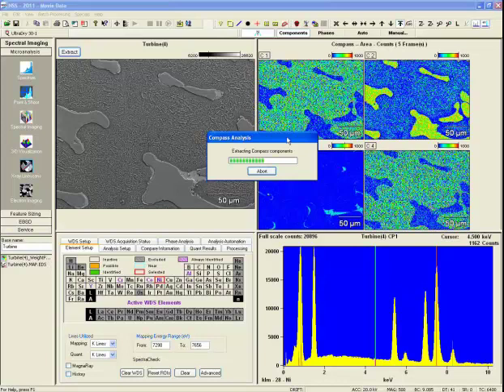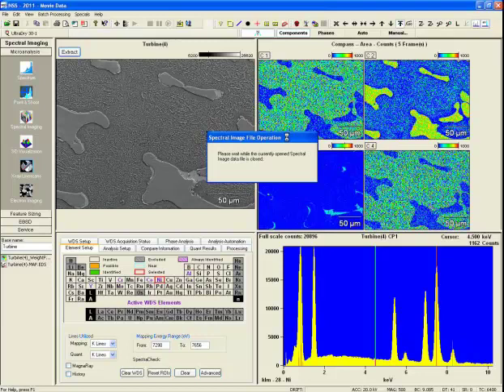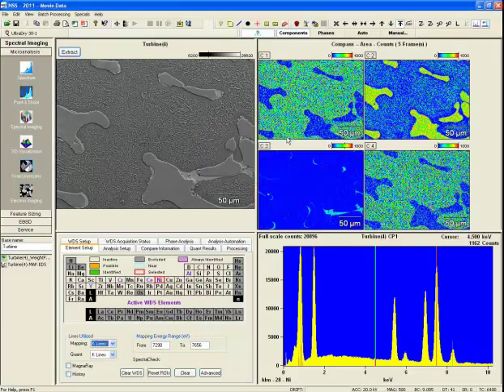Then we will get a spatial distribution map and a spectrum associated with each of the compounds or alloys or minerals within the material and within the statistical significance. So anything that is chemically unique will show up as a unique map. In this particular case, it's shown up as 4 different maps within the material. There's one additional interpretational tool that we have available, which is a phase analysis, which will take these COMPASS results and turn them into more easily interpretable results.